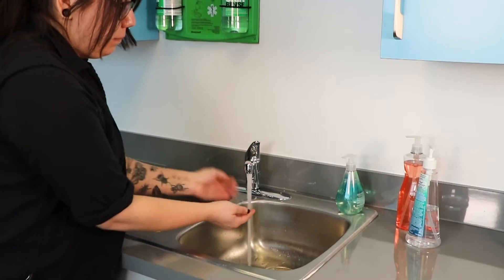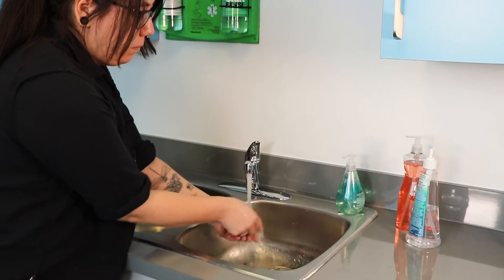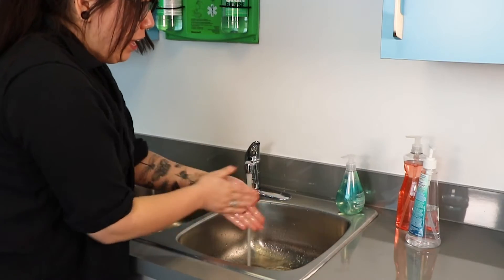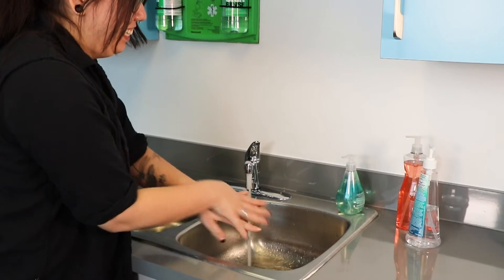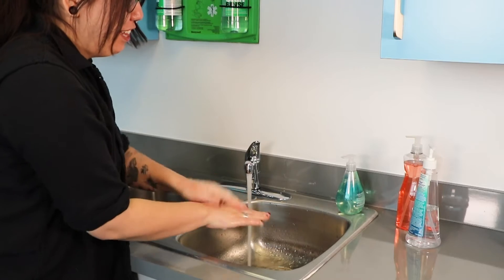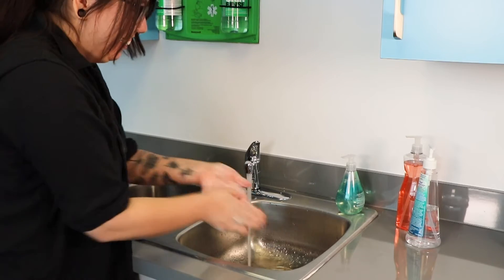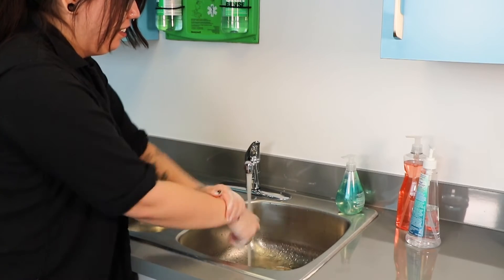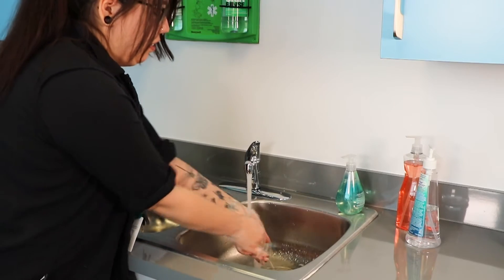Wash your hands before you take water samples. However, if hand washing is not possible, use hand sanitizer or an alcohol swab to disinfect your hands. Your hands must be clean. If they are dirty, they may contaminate the water sample. This may lead to incorrect data and will require resampling in these locations, even though the water in the distribution system may be perfectly safe.